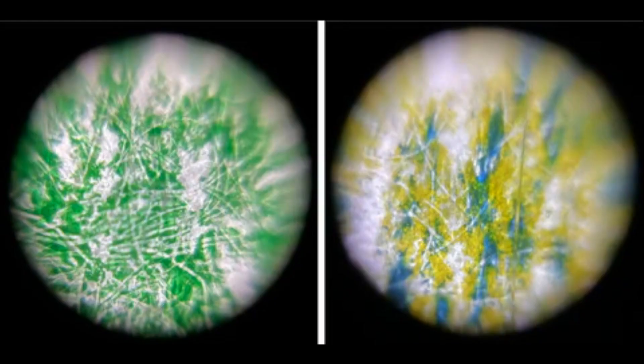This figure shows a piece of paper that has been colored in with yellow and blue colored pencils, allowing the two colors to mix in the middle. Just looking at the images with your eyes, the space between the yellow and blue appears green. However, when you look at the paper under a Foldscope, you can see the difference.